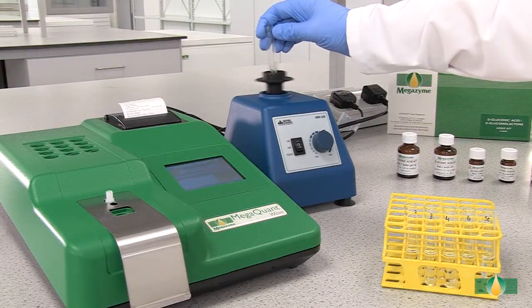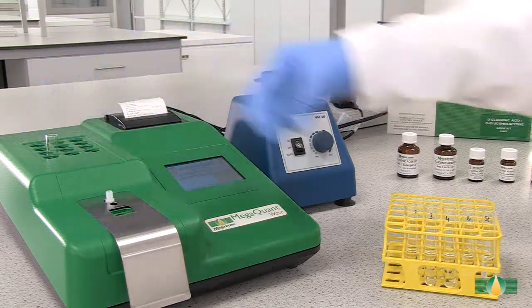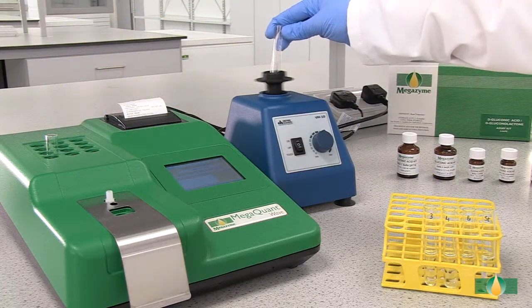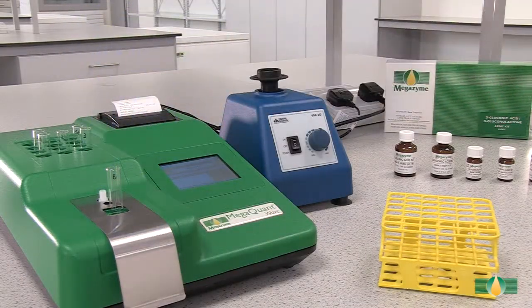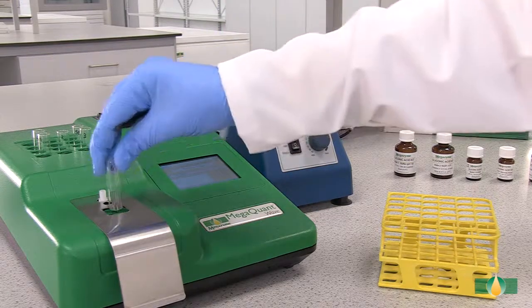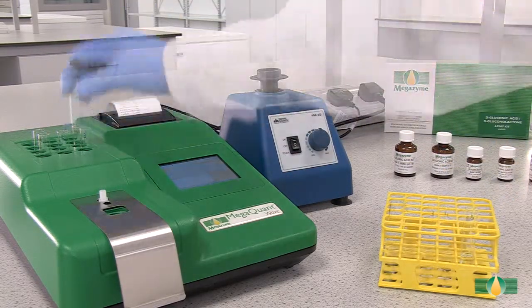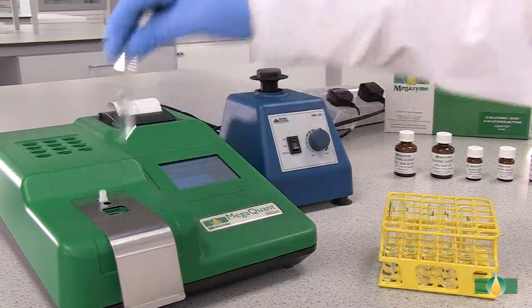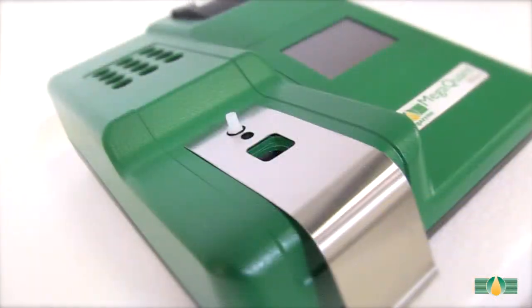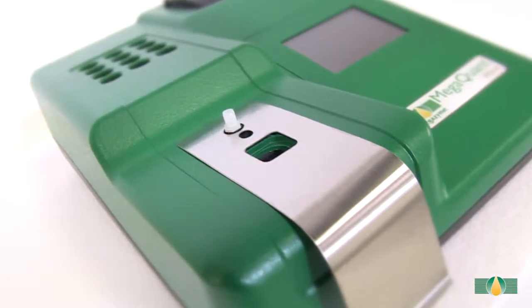When all of the components have been added, mix the tube contents thoroughly and incubate the tubes in the 37 degrees Celsius heating block for approximately 5 minutes. After 5 minutes, record the first absorbance reading at 340 nm for all of the assay tubes. In this demonstration, we are using the MegaQuant Wave spectrophotometer set to read at 340 nm.